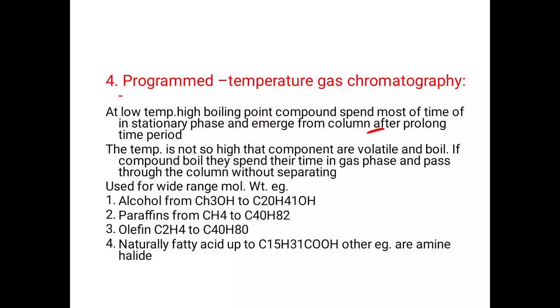However, a suitable temperature can be found at which compounds spend an appreciable but different time in the gas phase. If the sample contains compounds with widely different boiling points, a suitable single temperature cannot be found at which each component spends a reasonable fraction of the time in the gas phase.